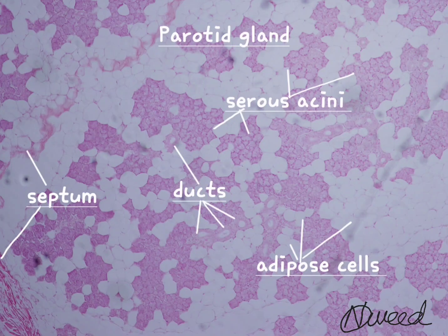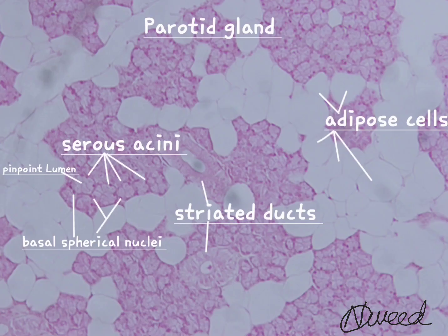The major salivary glands include parotid, submandibular, and sublingual glands. These are compound tubuloalveolar glands, each of which is surrounded by a capsule of dense irregular connective tissue. From the capsule, connective tissue septa extends into the glands and divides it into lobes and lobules.